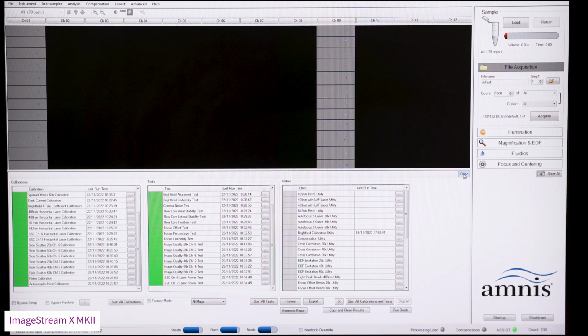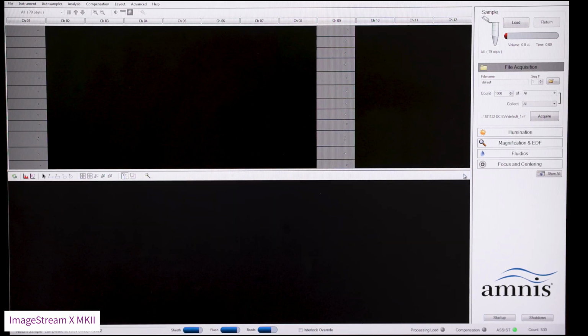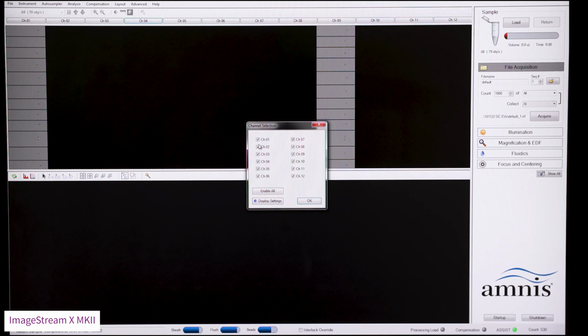To set up an experiment, close the assist test window, and we first need to select the detection channels needed for the experiment. Refer to the instrument manual to determine which channels are required for the fluorophores in your experiment. Click any channel button at the top and tick the boxes of the channels that are required. Remember to keep the bright field channel set here as channel 1 and 9 and the side scatter channel set here as channel 6.